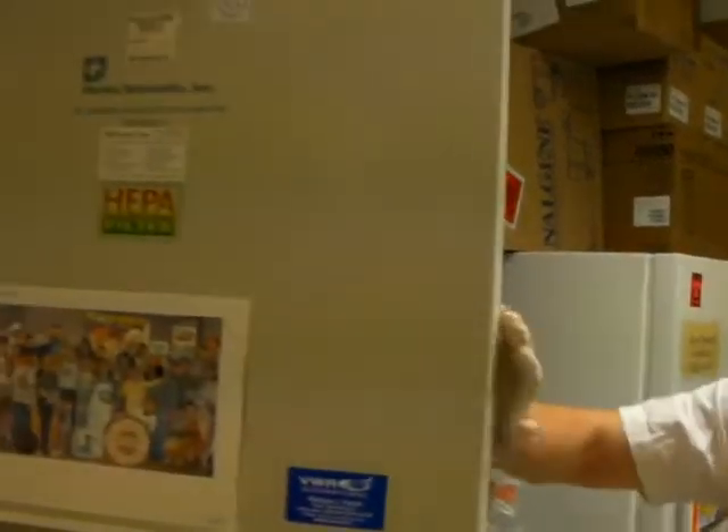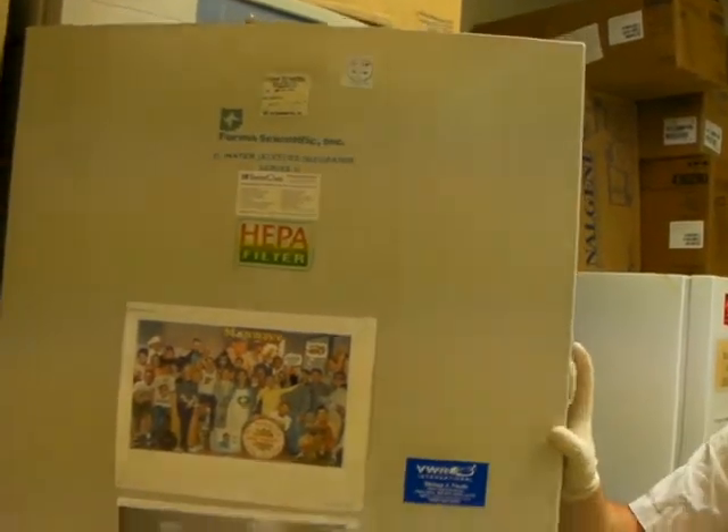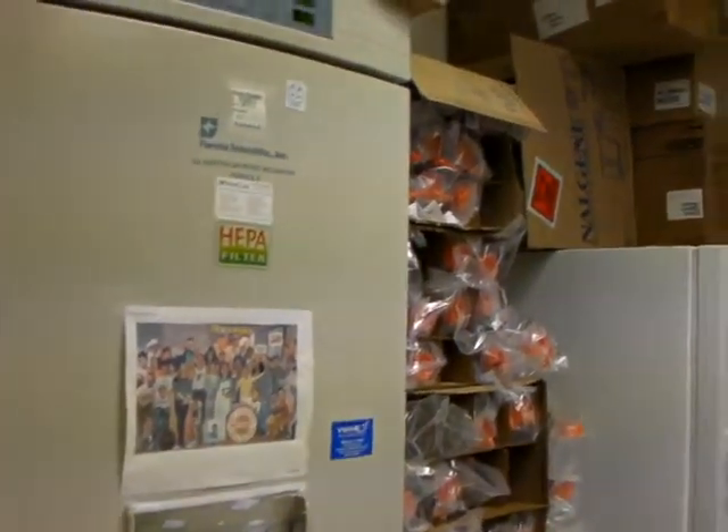This is our incubator. It's kept at 5% CO2 level to keep ourselves nice and well-balanced, and a temperature of 37 degrees.